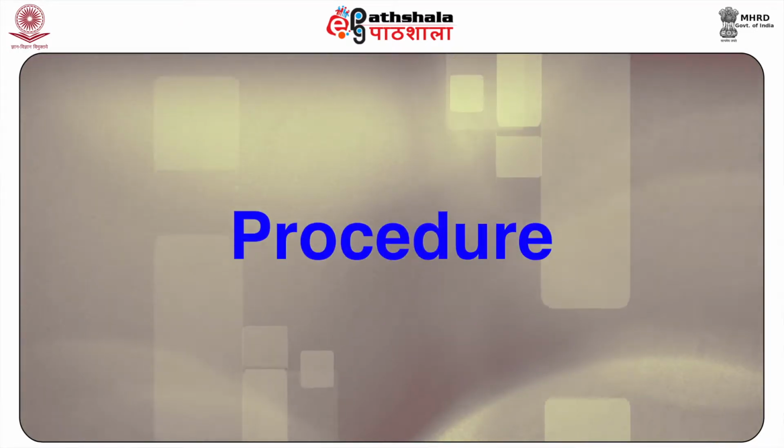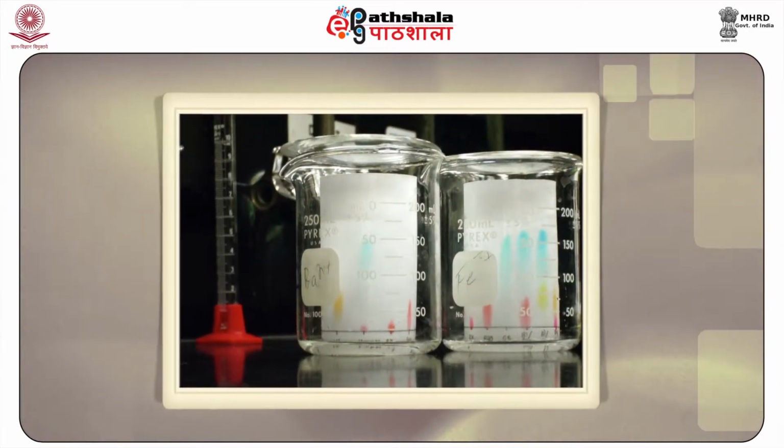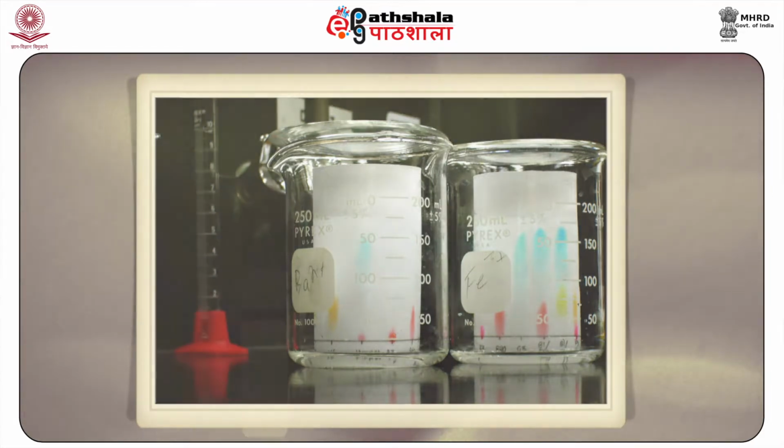Next, moving on to the procedure, the sample under analysis is placed on a filter paper, one end of which is immersed in a solvent. The solvent diffuses up the paper, thereby dissolving and separating the various sample components.